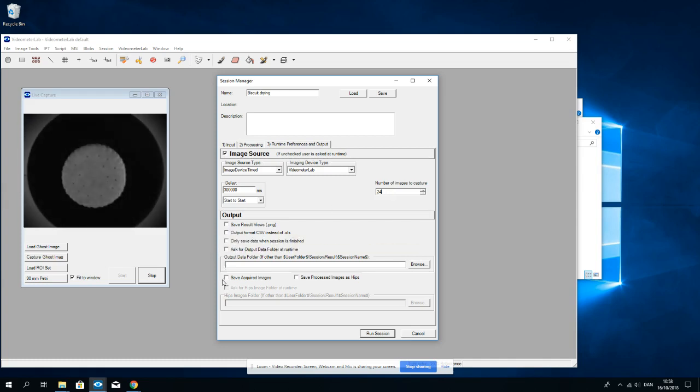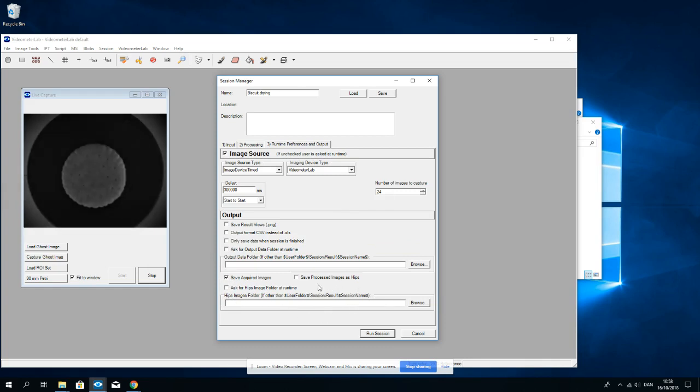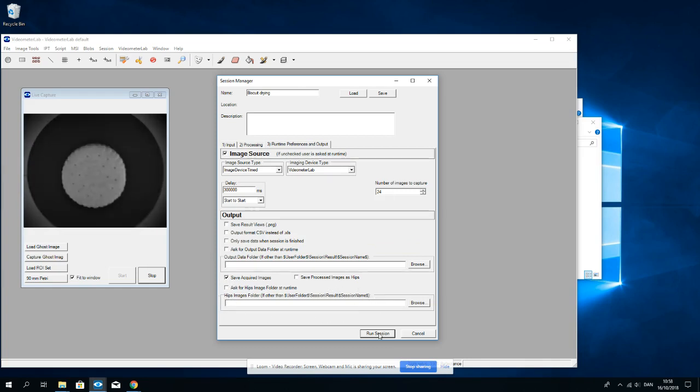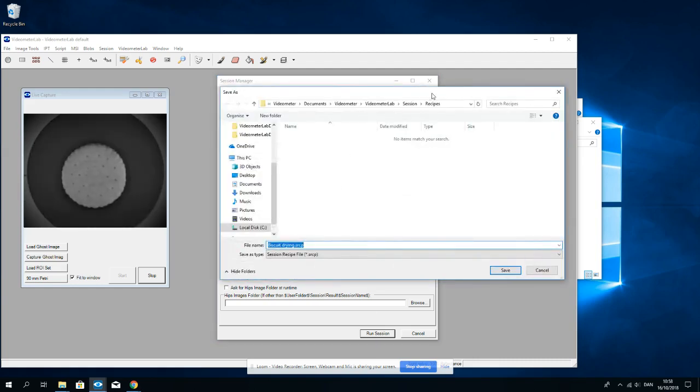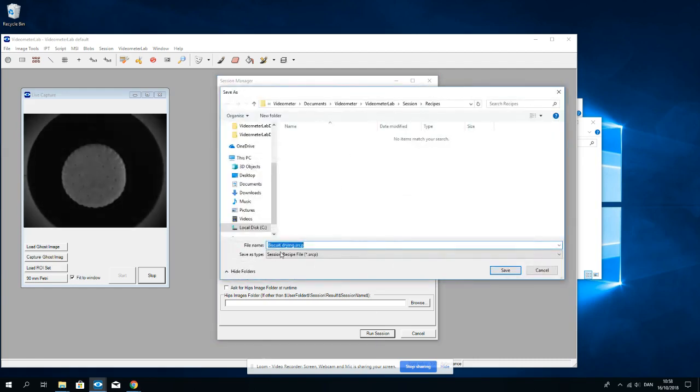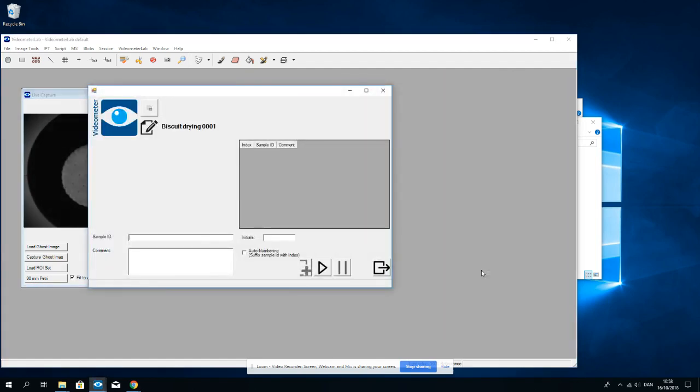So to save the images, I tick on save acquired images, and it will save the images in the default folder given down here. I now click Run Session. I save the recipe as biscuit drying so that I can run it another time.